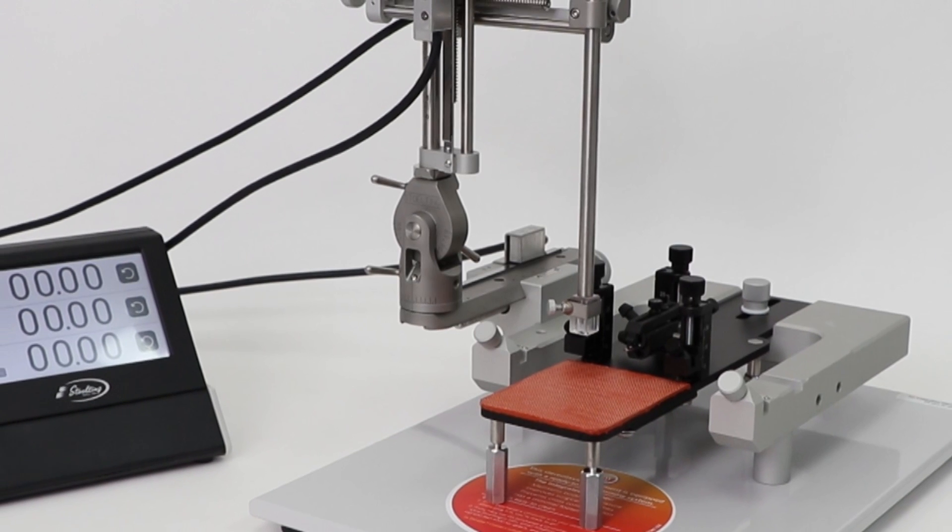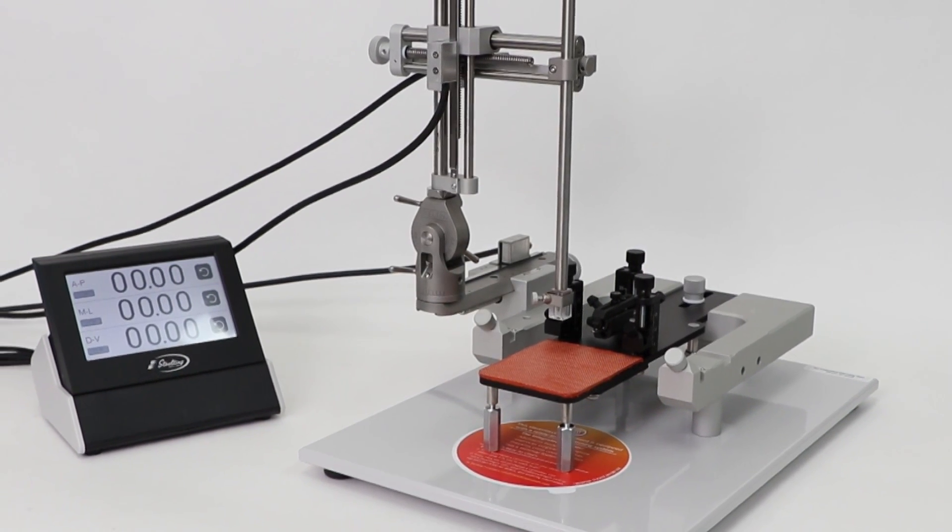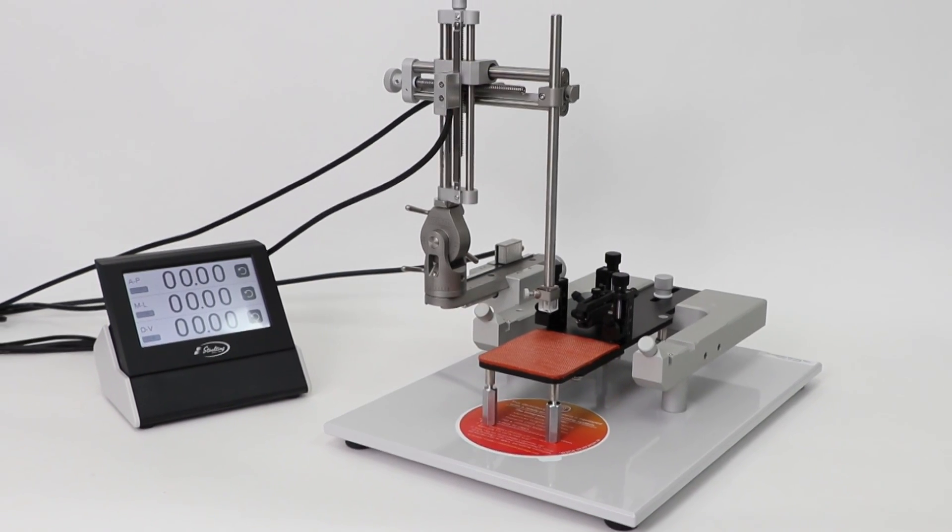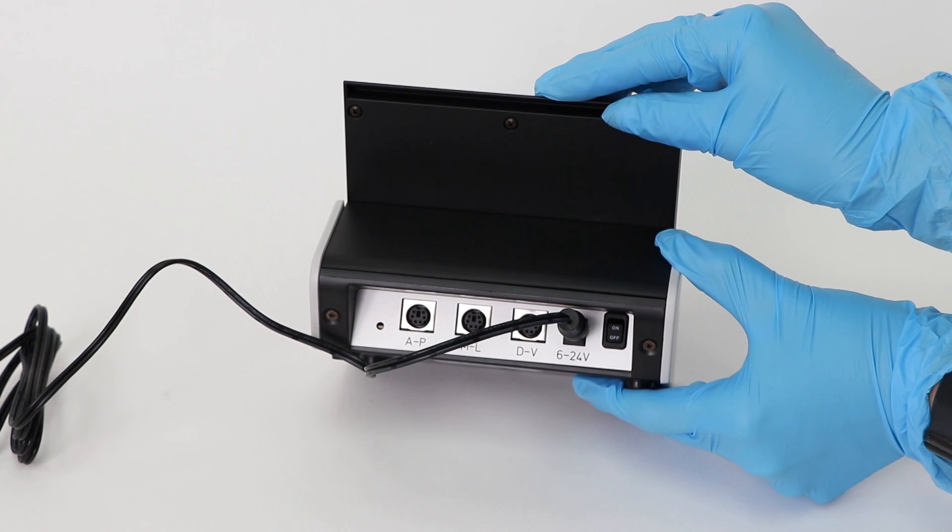Let's take a look at how to set up a digital rat mouse neonatal rat stereotaxic frame. In a few steps you will be up and running. First, plug in the power cable to the digital display.